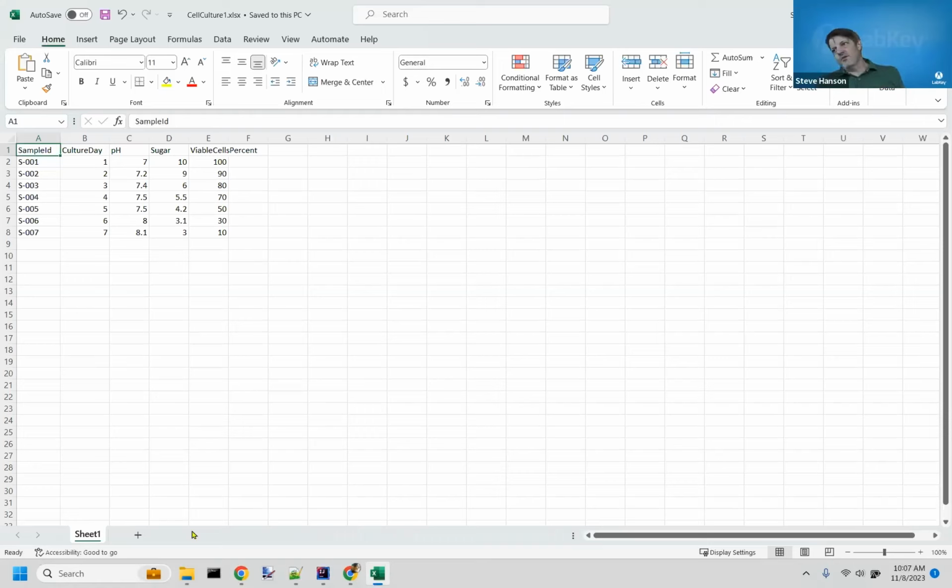We support different kinds of databases like Oracle, MySQL, Postgres, Microsoft SQL Server, SAS, maybe even some others, Redshift maybe. If you have data in those kinds of containers, you can have a little connectivity code that goes there and says, hey, give me that data. It's really just a little database URL.